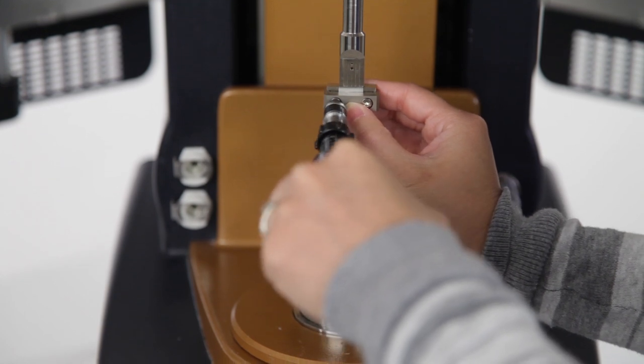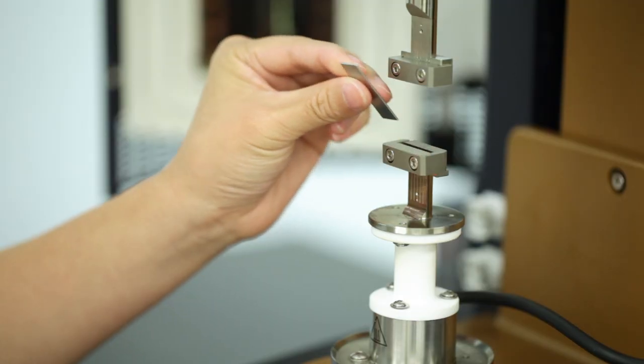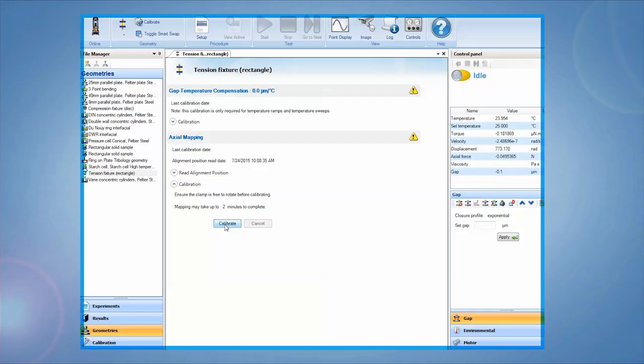Carefully tighten the screws. Use the TRIOS software to read the alignment position through the geometry's calibrations. Once finished, remove the alignment steel shim and perform the axial mapping.